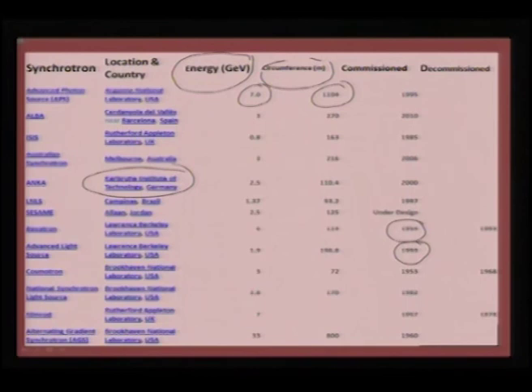and equally important are those in Germany, but we are also in the game in a smaller way. For example, if you look at the Indian situation, we have two synchrotron light sources, both housed in Indore, called Indus 1 and Indus 2, but you would see the circumference or the diameter of our source is very small compared to what we saw in the earlier case.